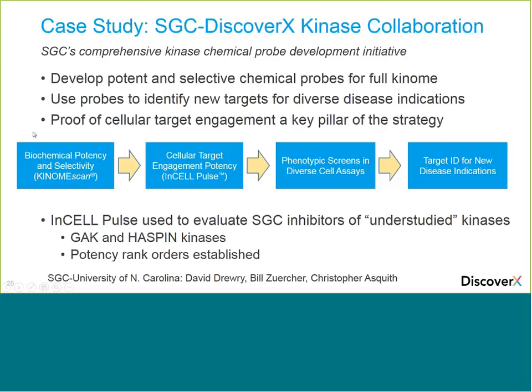So what they start with is they have some very nice collaborations with pharma, where they're able to get their hands on some diverse inhibitors, assemble a set, and they screen that set, and they're doing a lot of the screening with us with our KinomeScan platform, and identify out of these compound libraries that are 500-600 molecules, for which kinase targets do I have potent and selective molecules, with a real focus on the understudied kinases.